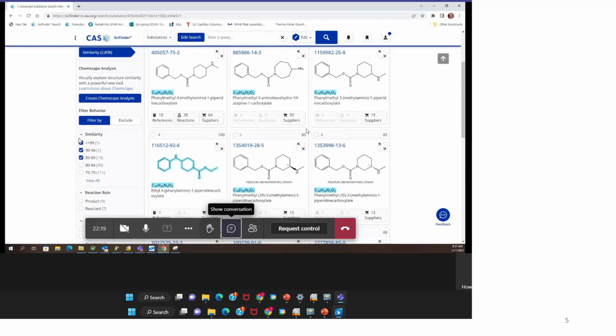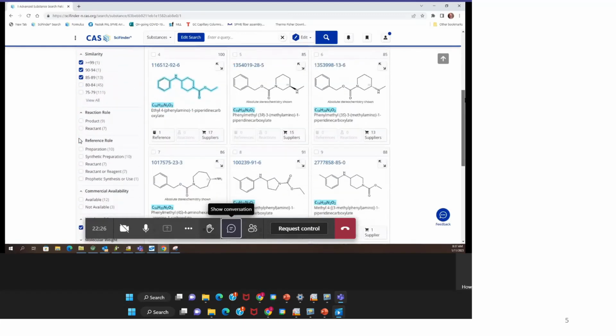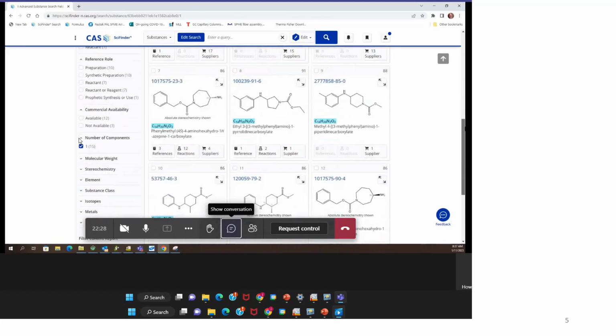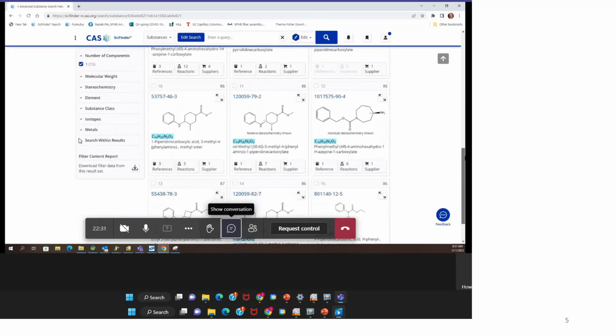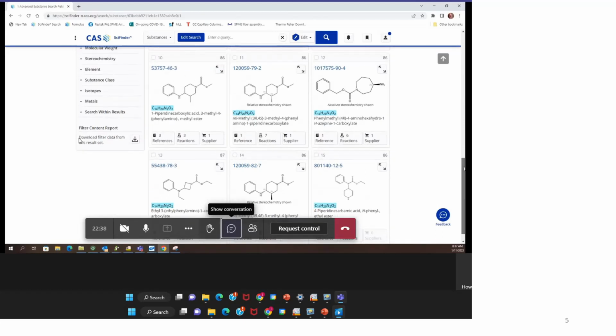And we'll just take a look through them and see if we had any other possibilities that might spur some thought about the possible identity of the compound if we hadn't known what it was from the data, just to get other ideas of how it compares to the fragmentation we observe in the EI mass spectrum of the compound. So that's pretty much it. I just wanted to show you how that compared to the ChemSpider one that I've done before, so you can take a look at the other resource video to see how that compared, but both of them do Tanimoto searches.